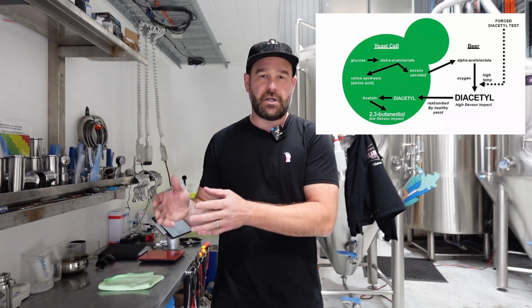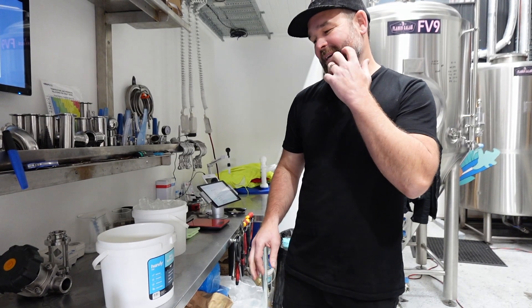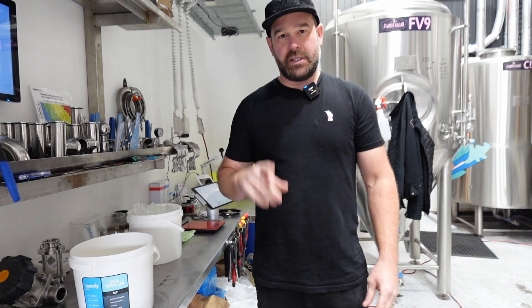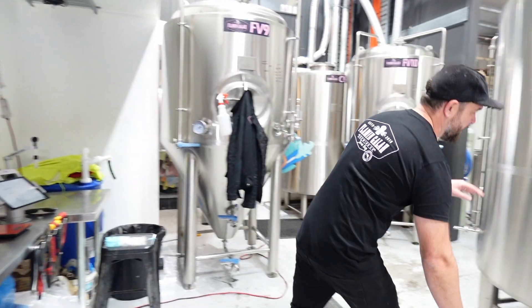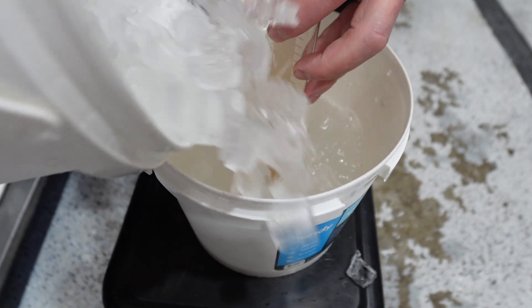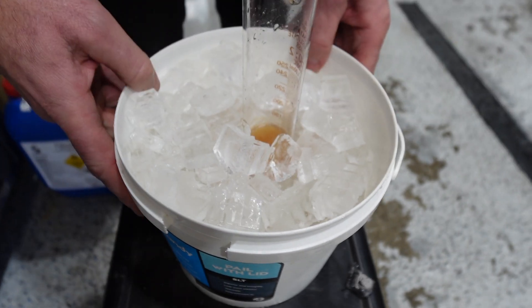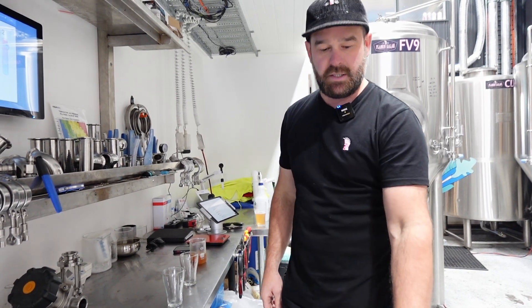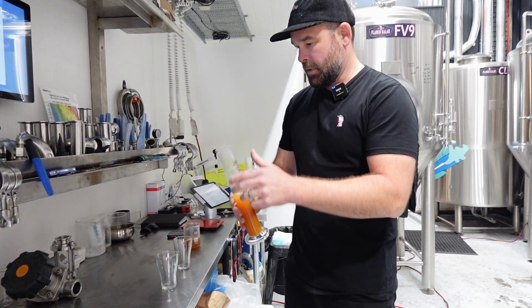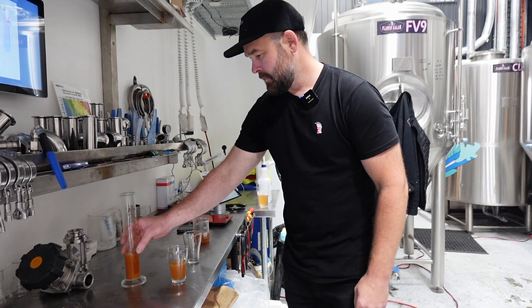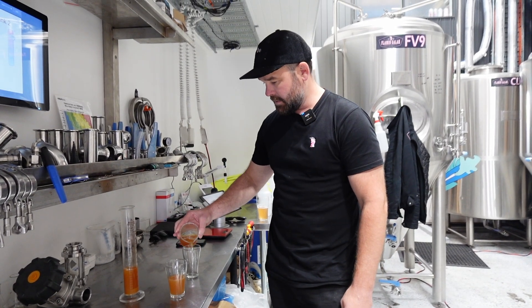To find out whether you've got diacetyl still in your beer: we've got ice and a little bit of cold water because we want to chill this sample as quickly as we can. Straight into the cold water, pack the ice around it, and throw it in the cool room to help a little bit more. We've chilled our forced diacetyl test down to roughly 4 degrees C. Pull that out and put it in a sample glass - and then we've got our control for the experiment in the other one.